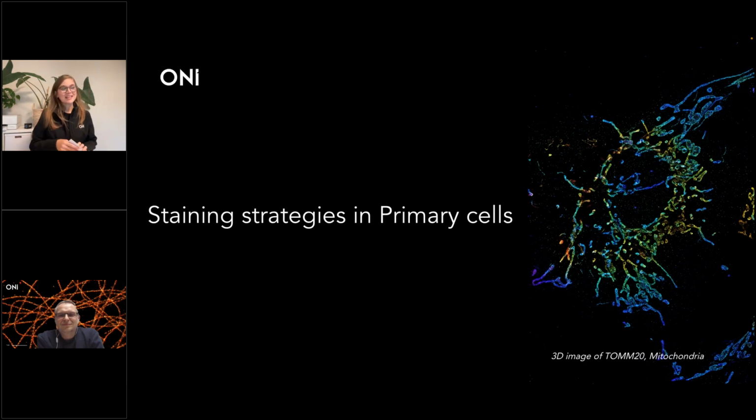Moving on to another application, we have a question regarding the visualization of synaptic structures in brain tissue. The question is whether you can comment on what strategies are employed to optimize the labeling of synaptic proteins. Yeah, we have some applications on our webpage that show how to do imaging in tissues. Yes, you can study imaging in tissues.